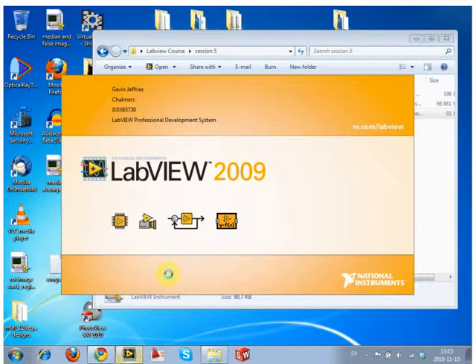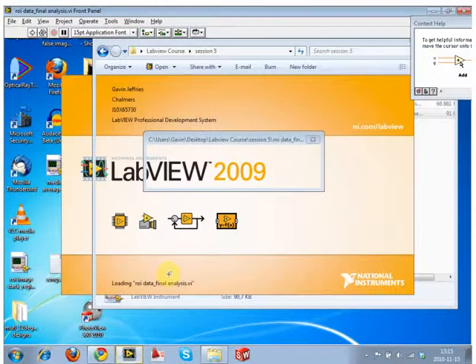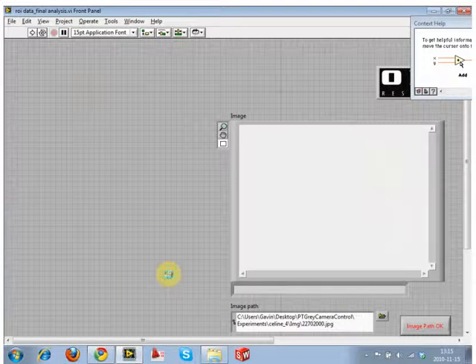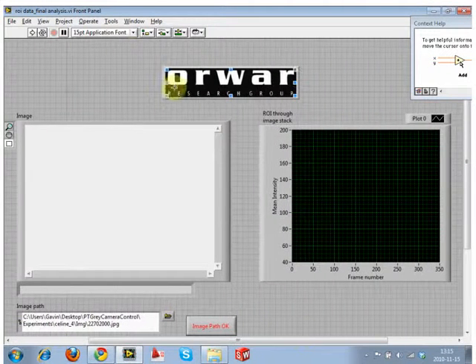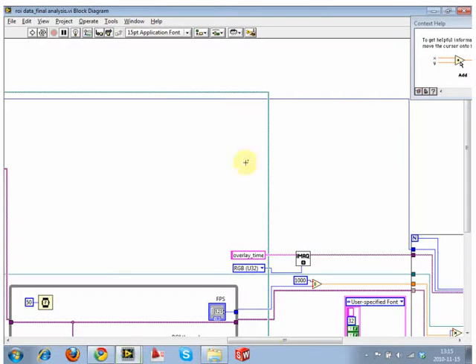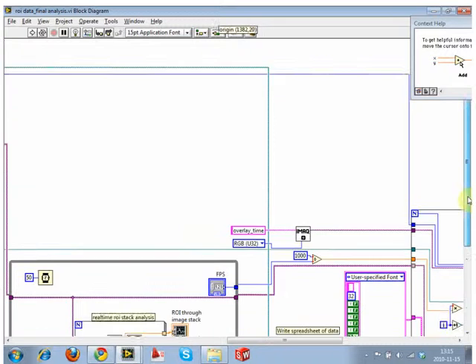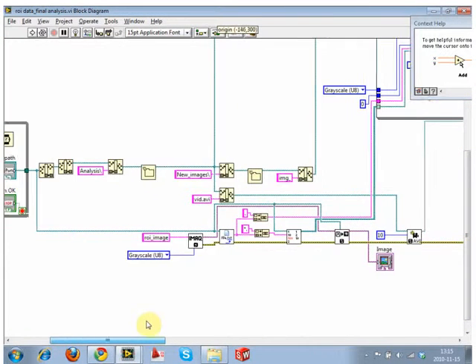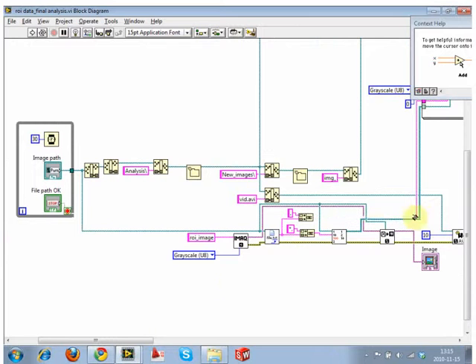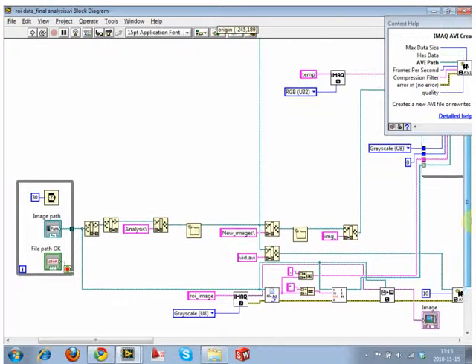What we're going to look at is, first of all, I'll just go through what this current block diagram has on it, and then we will continue. If you watch the video, you'll see what the program does, but just quickly, I'll go through it now. It looks big and scary, but don't be put off. It's not that big and scary.